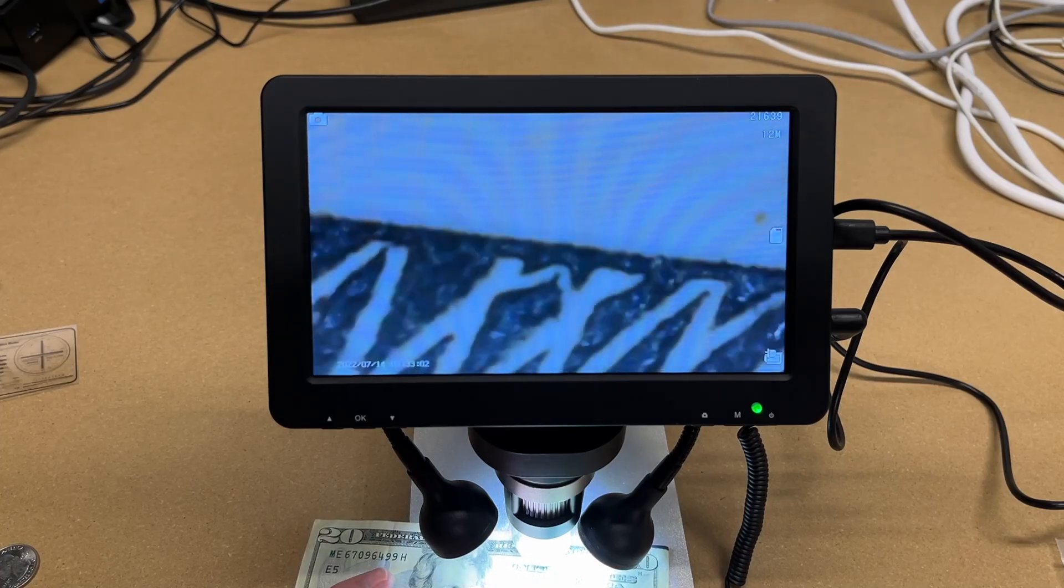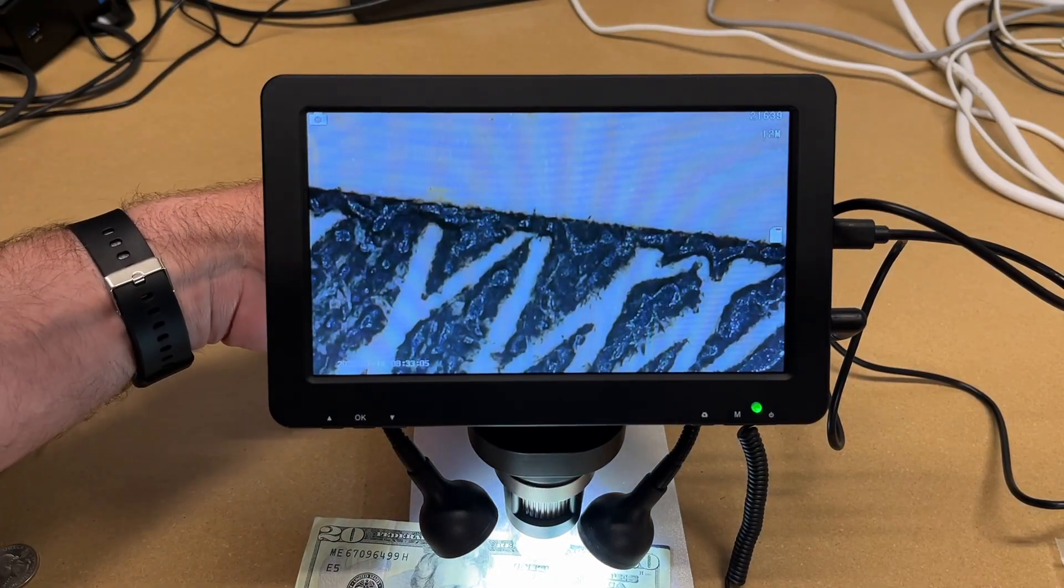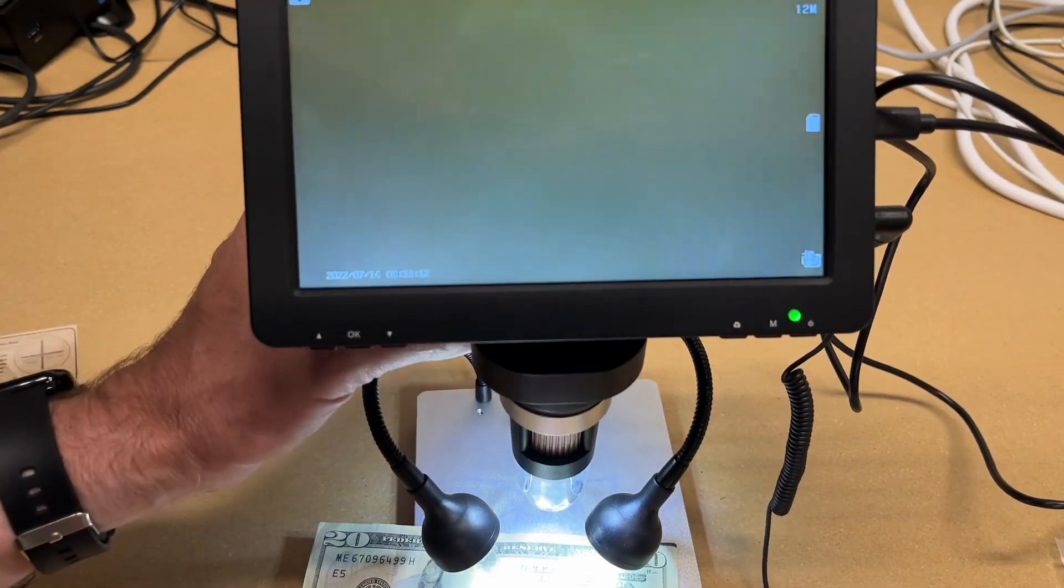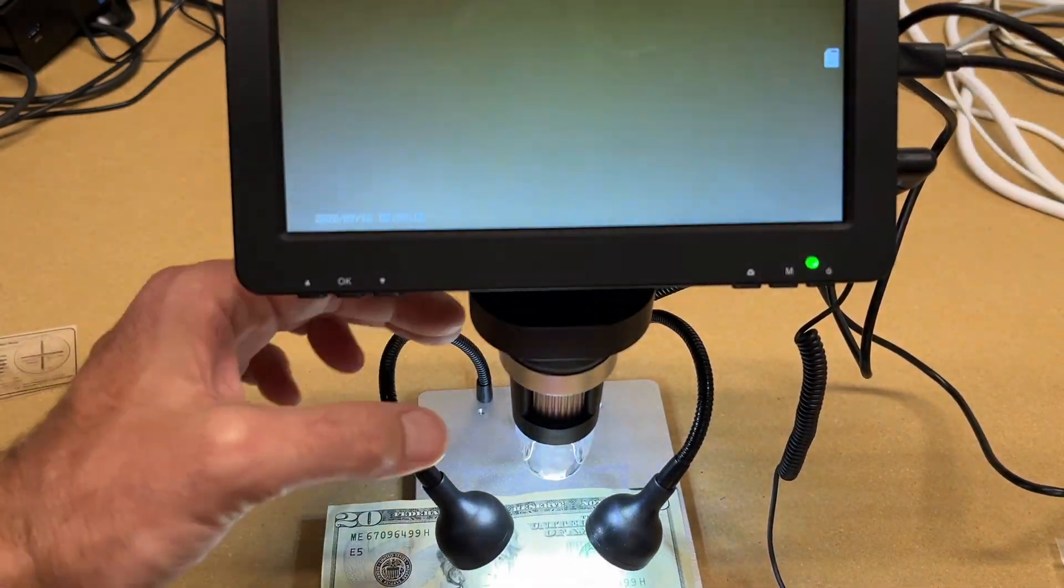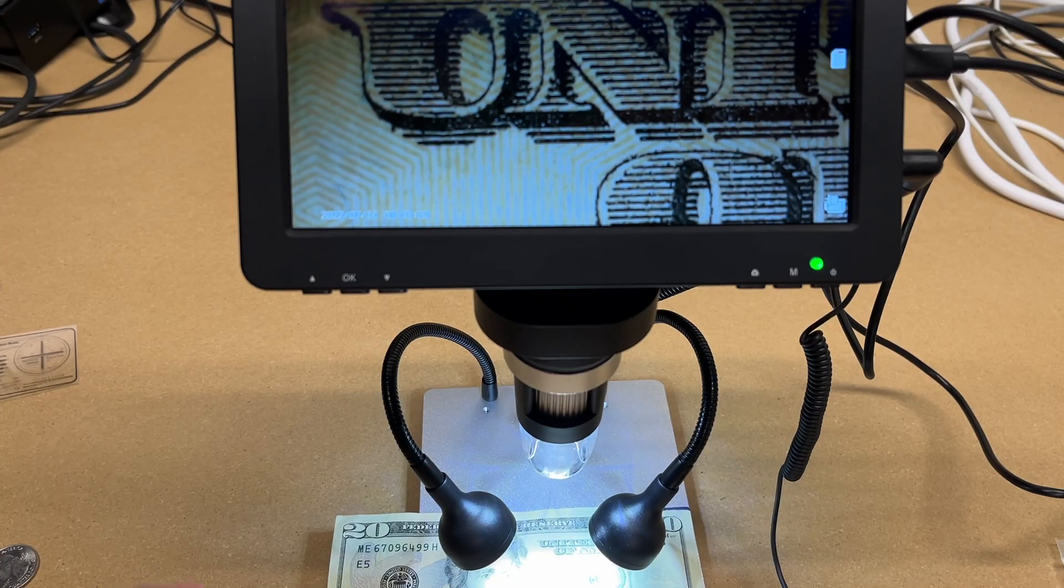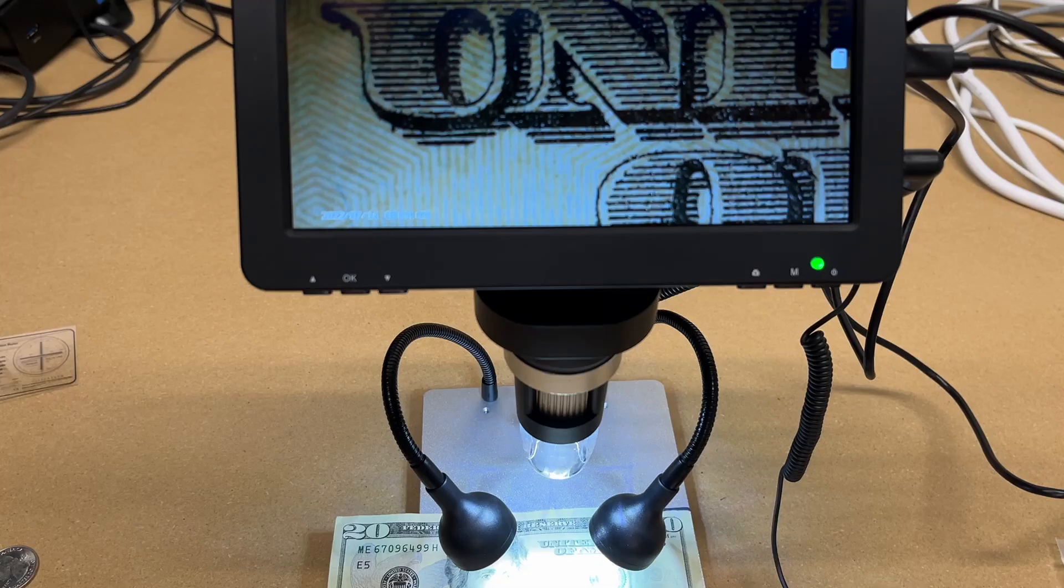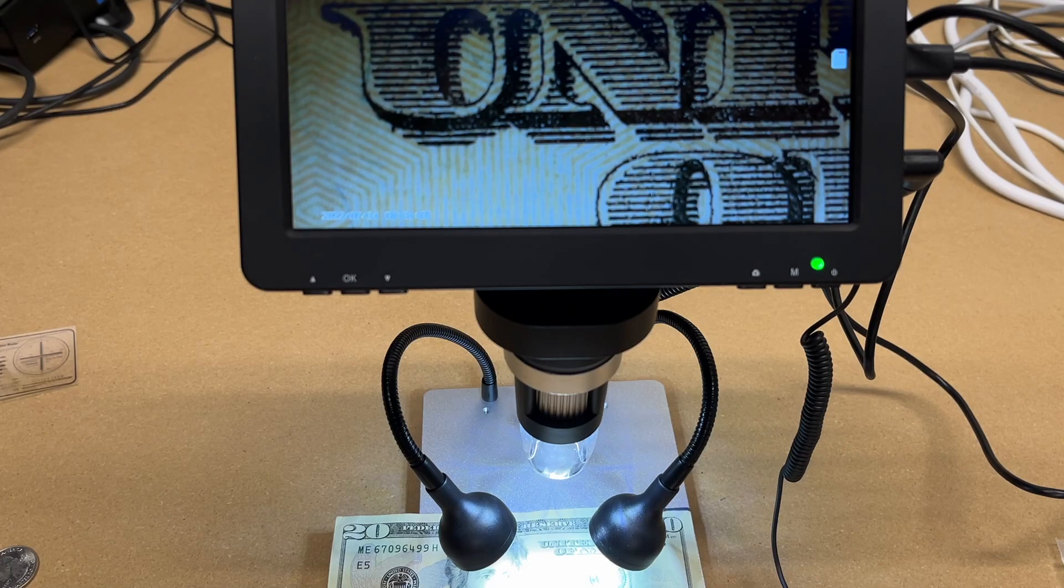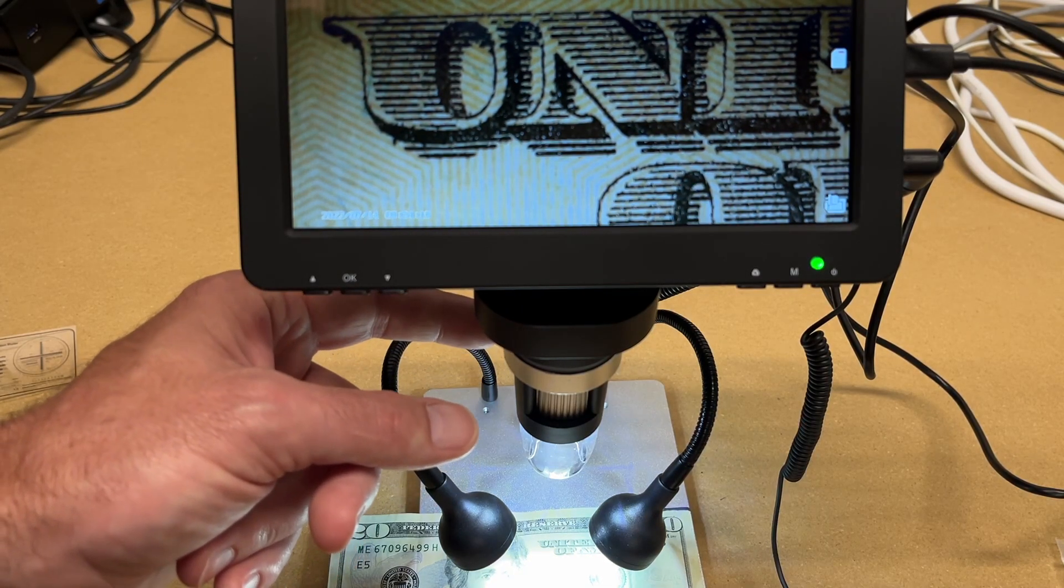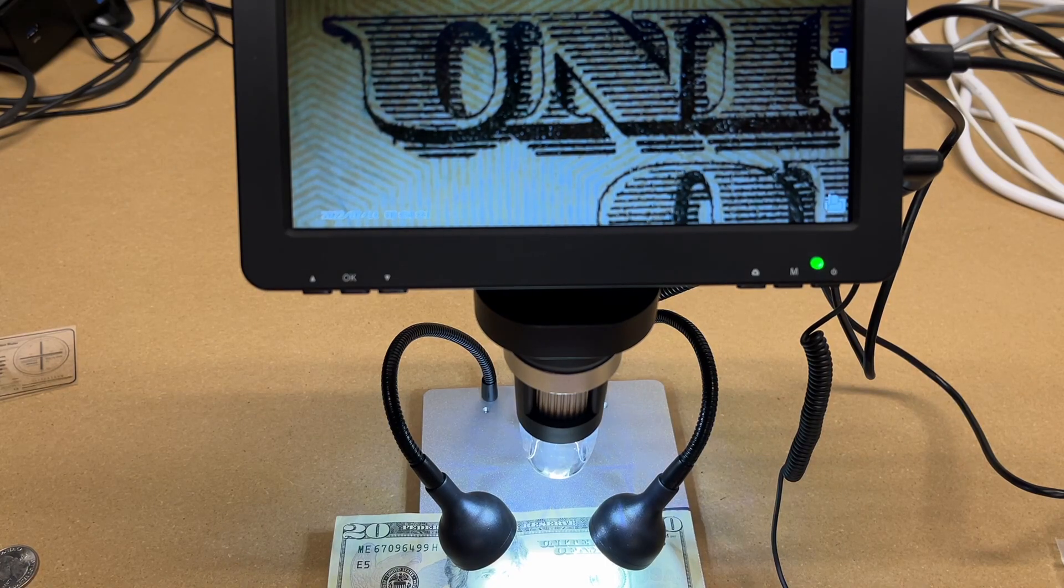Let's move it around. Now I can zoom this out. I'll loosen the back. I'll lift it up all the way. And here we're zoomed further out. So the magnification on this is 50x to 1200x. So if this is up higher, it's going to be zoomed in less. If it's down closer, it's going to be zoomed in more.